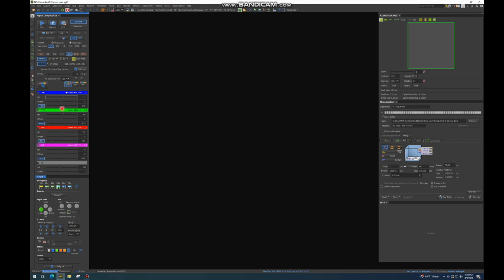adjusting the brightness and the laser power for each laser. HV is the gain, which is equivalent to just the brightness. Gain is entirely artificial, so it does not impact your sample in any way. And this is a really great place to start when you're beginning to optimize visualizing your sample. What I suggest you do while you're adjusting the gain, increasing or decreasing brightness, is to actually scroll through the Z position of your sample to ensure that the brightness you're seeing is accurate and not just in the wrong plane.